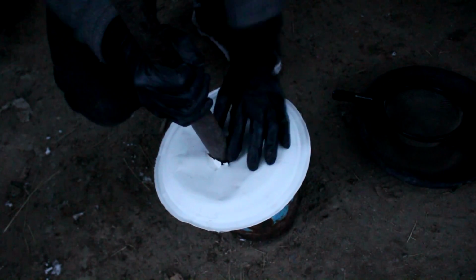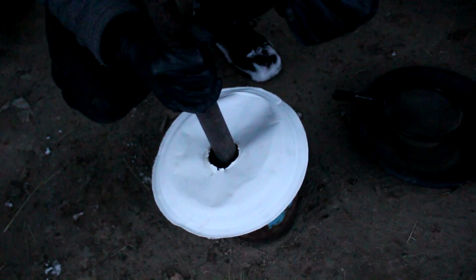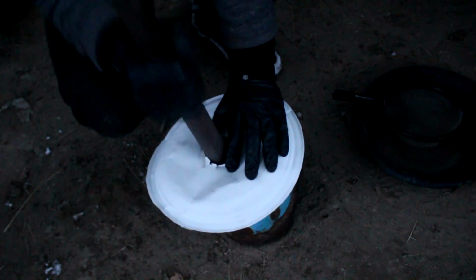I'm also wearing a dust mask, but I do tend to take it off to talk to the camera, so I'm not muffling my voice. The radiation that I'm working with here is really not a problem unless you ingest it, hence my precautions from breathing it in. Alright, so I'm just going to continue crushing, nice and slow, to minimize dust.